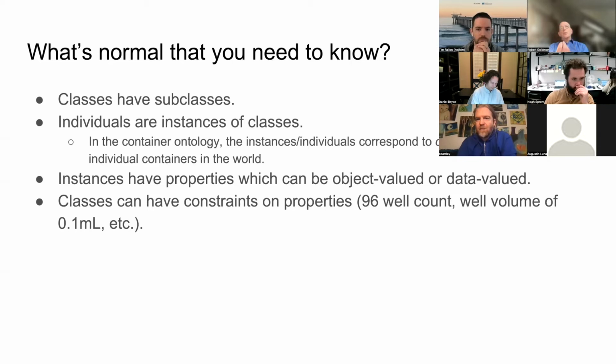And basically the reason that it is that way is that we need a way to tell when you look something up, when you've found enough information about a container. So when you've really gotten down to something you could order or pull out of inventory. And if everything was classes all the way down, it would be very hard to know when your lookup is done.